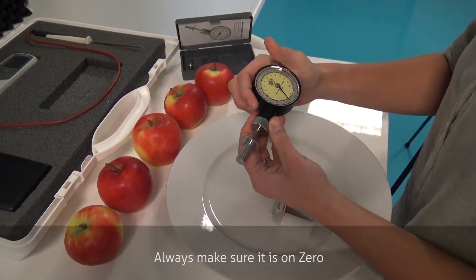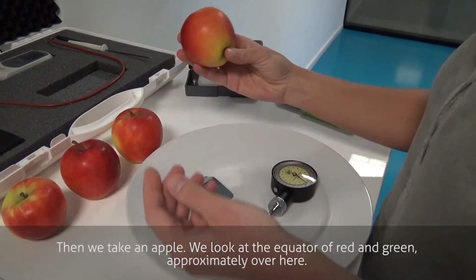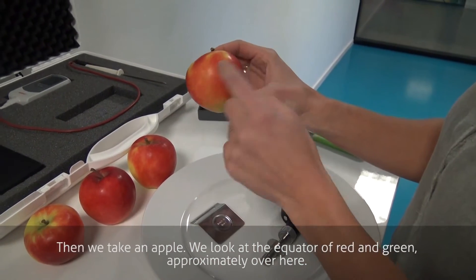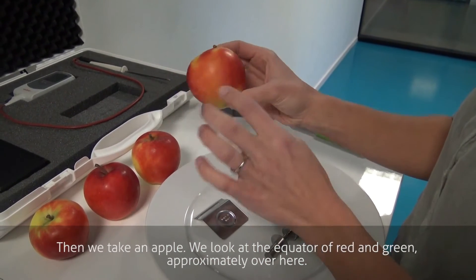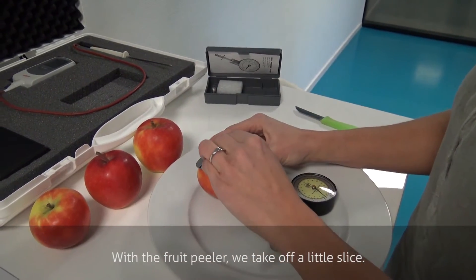Always make sure it's on zero. Then we take an apple. We look at the equator of red and green — it's approximately over here. With the fruit peeler we take off a little slice.